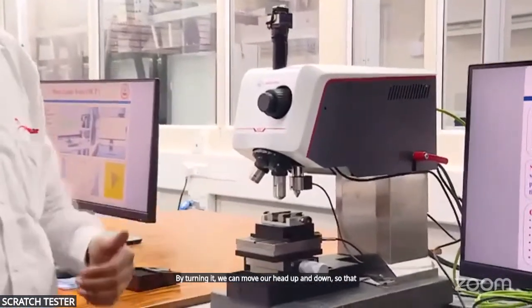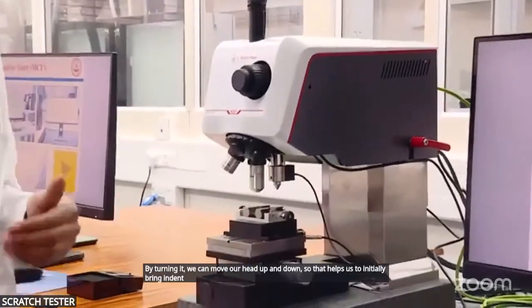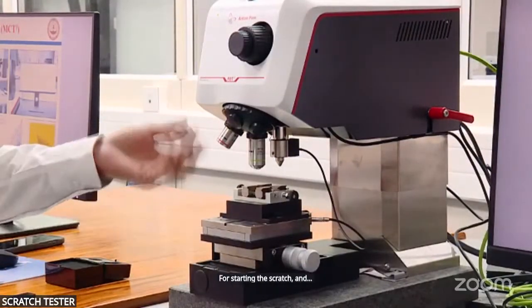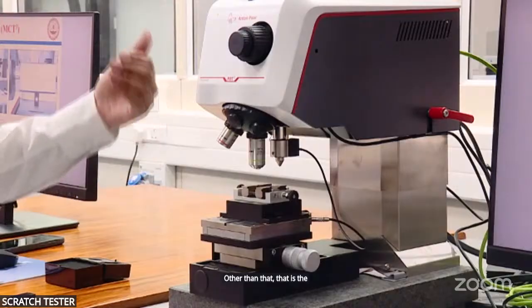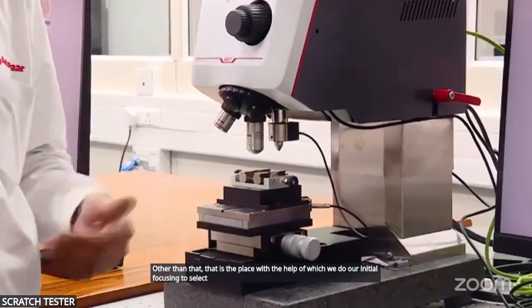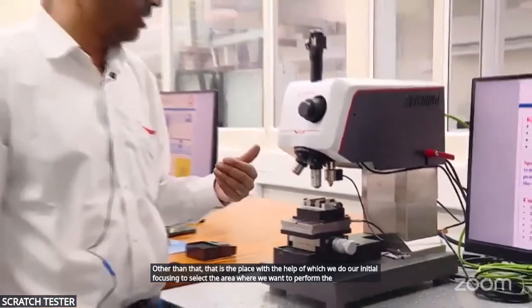So that helps us to initially bring the indenter close to the surface level for starting the scratch. And other than that, that is the place with the help of which we do our initial focusing to select the area where we want to perform the scratch testing.